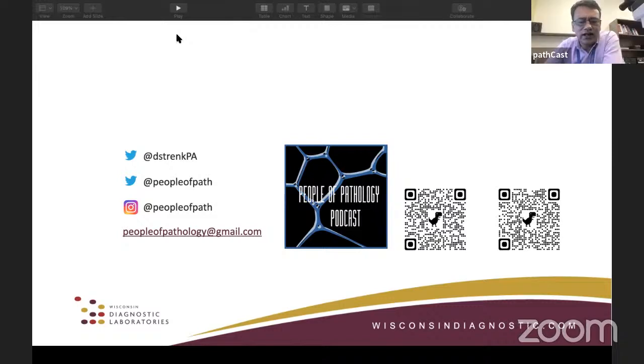Right. I think you guys all understand what Mr. Strenk is talking about, perpendicular sectioning of the uncinate or the retroperitoneal margin, because that word is used differently in different parts of the world. So here we use more often uncinate margin, and it is something similar when you do perpendicular margin of lumpectomies, right? So you basically slice it first and then take perpendicular sections so that we have ink on the surface, and then the other surface is towards the specimen. Is that what you mean, isn't it?